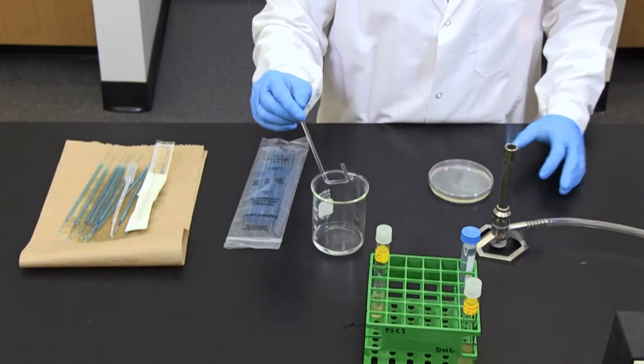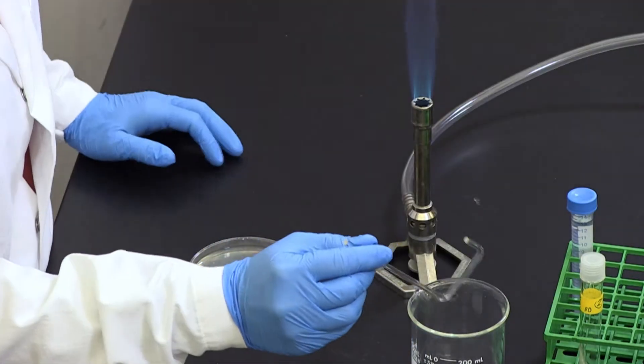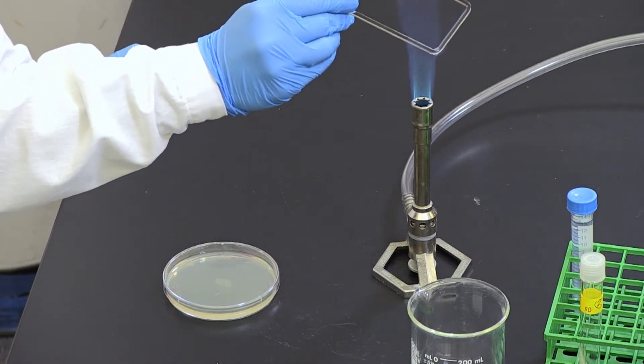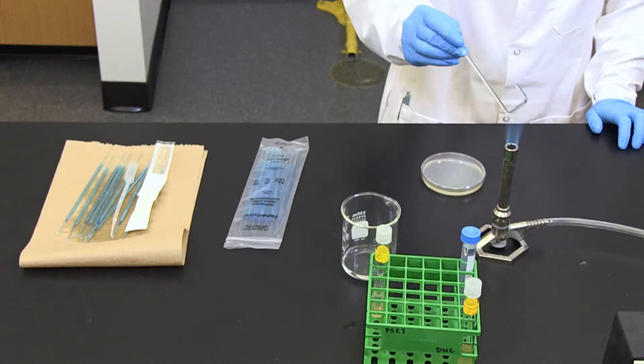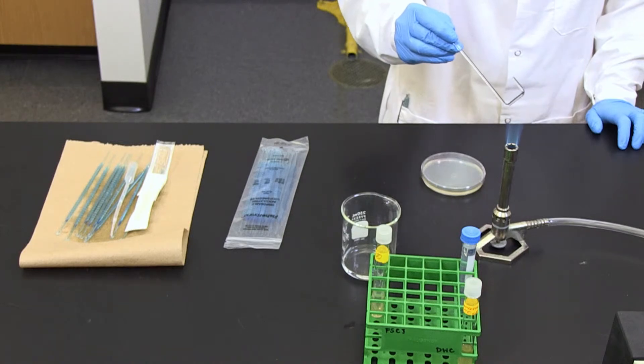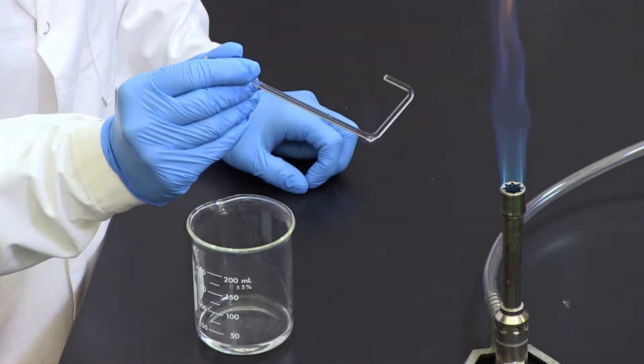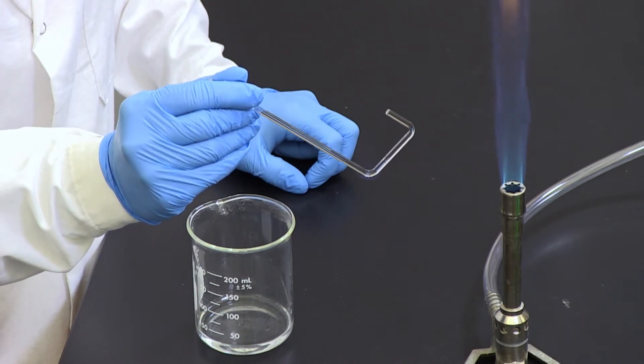Third, pass the glass cell spreader through the Bunsen burner with the bent portion of the rod pointing downward to sterilize. Keep the beaker of ethanol away from the flame and allow the alcohol to burn off the cell spreader completely. Let it cool for 10 to 15 seconds.